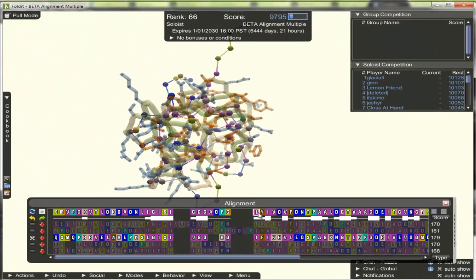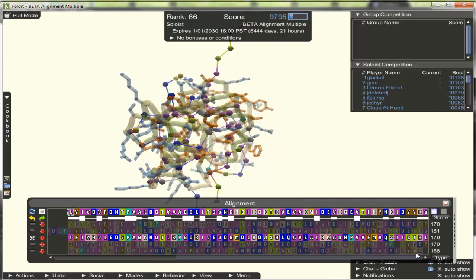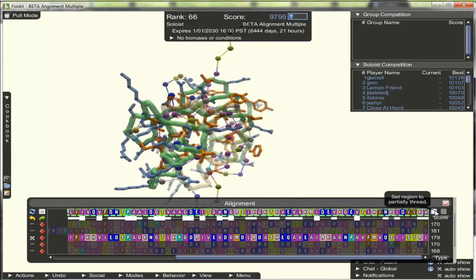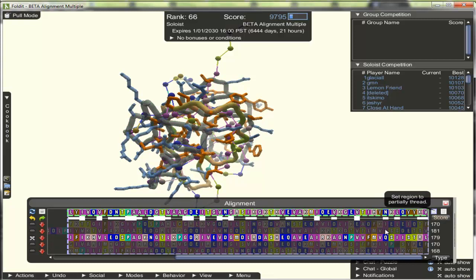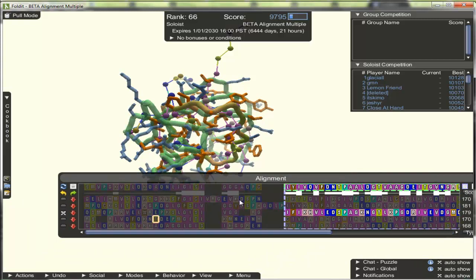In order to mark the region, click one end of the region, hold down shift, and then click the other end. And then press this button here, and that will mark the region to be partially threaded. You can see the rest of it is grayed out.